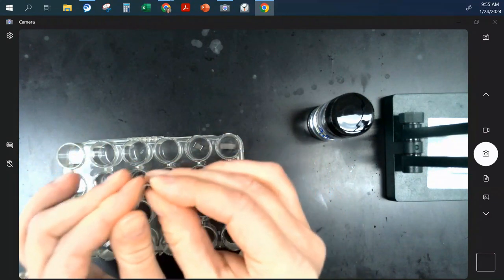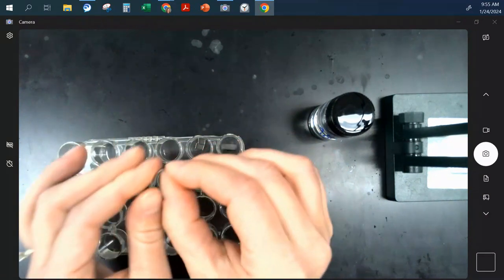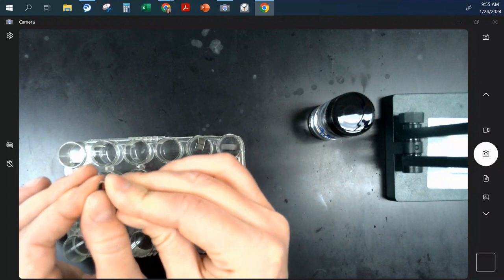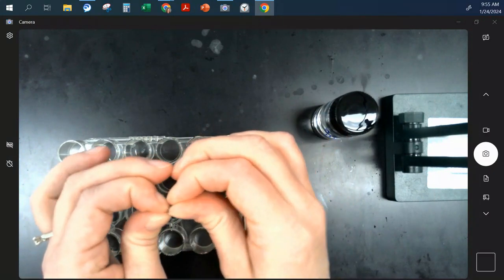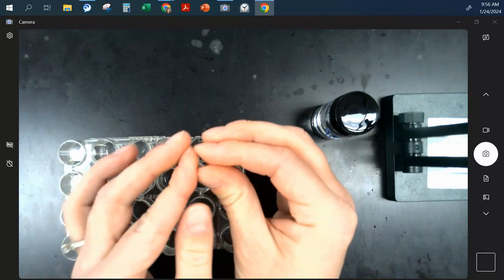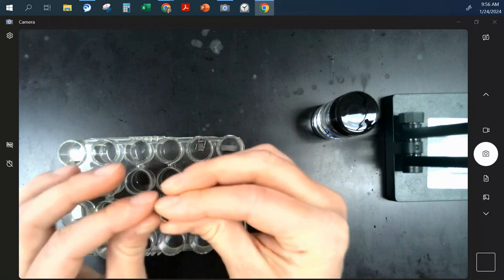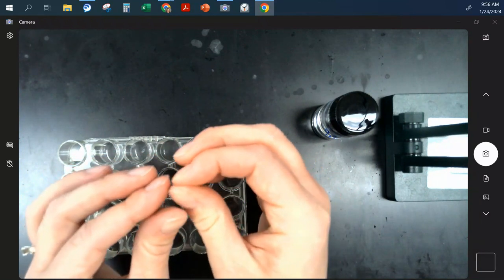Okay. What if I wanted to test the temperature? How temperature affects this reaction? So what could I do? Yes. Thank you for saying that. We wouldn't want to change 2 things at once. So if I want to use this one for changing temperature, I would only change the temperature.